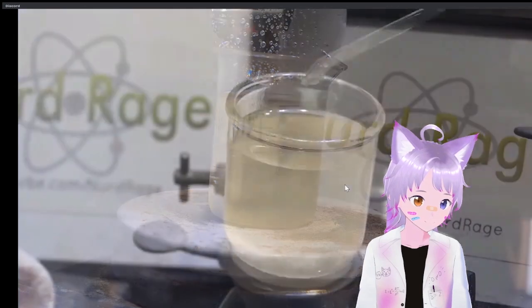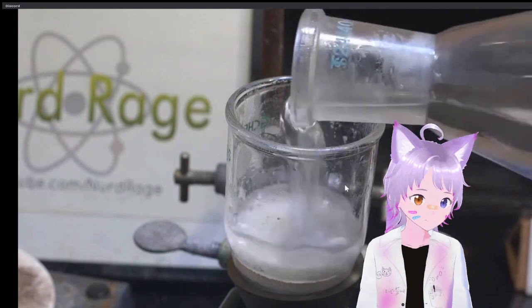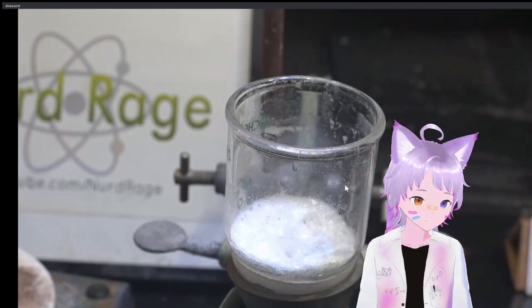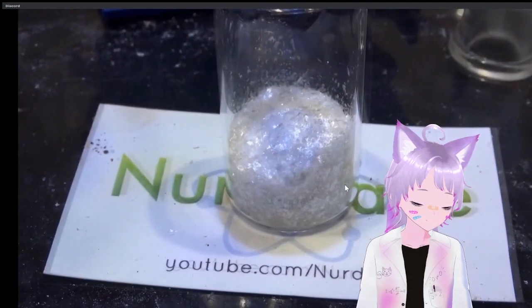And here we go. Now filter the crystals and wash them with some ethanol, then wash them with diethyl ether. Now leave under the vacuum stream to dry. And there we have it, two years of work.